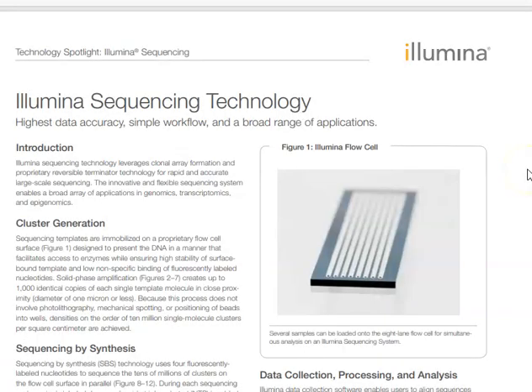So we'll start with the PDF document that Illumina have supplied explaining the sequence technology, and this all takes place on what we call an Illumina flow cell. And this technology requires fragmenting the DNA and somehow attaching them to this flow cell and then performing what we call clonal bridge amplification. So if you can imagine taking a piece of human DNA, fragmenting it into small pieces, and we actually attach oligos to each end, and those oligos on each end of the fragmented DNA bind to oligos which are pre-populated on this flow cell.